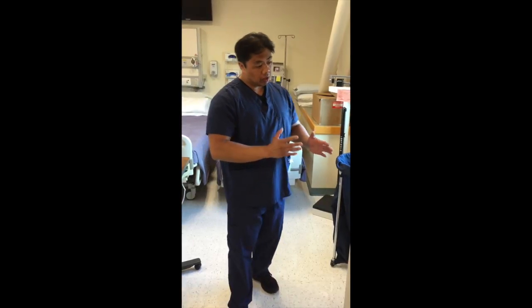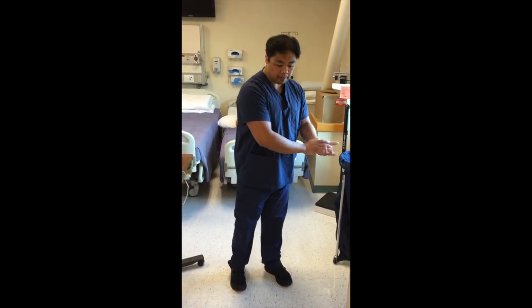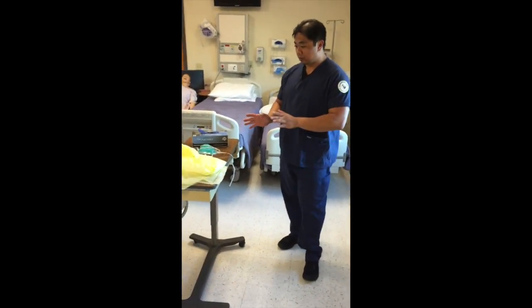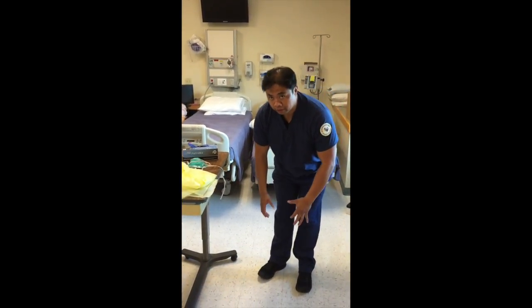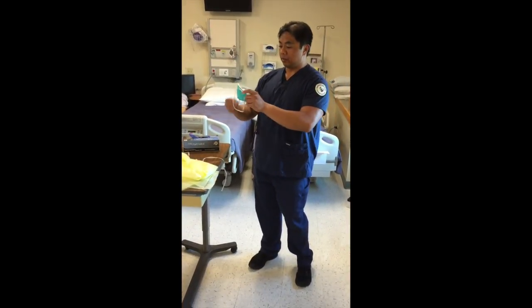So you would wash your hands for 15 to 20 seconds. Then you would start putting your PPEs on. First, you would put on your shoes, your shoe covers. Then you would put on your mask. The way you would do it is here.